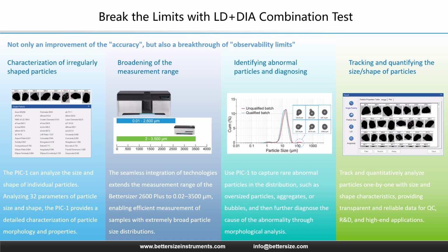This solves the critical blind spot of traditional diffraction, distinguishing tails in your data. You can now visually confirm if a deviation is a rigid aggregate affecting quality or merely an air bubble, providing the physical verification that statistics alone cannot offer.